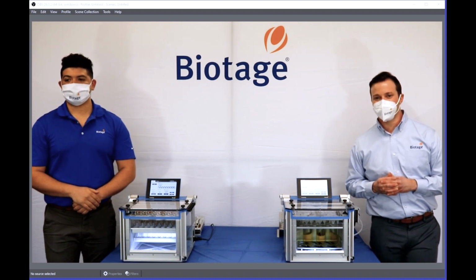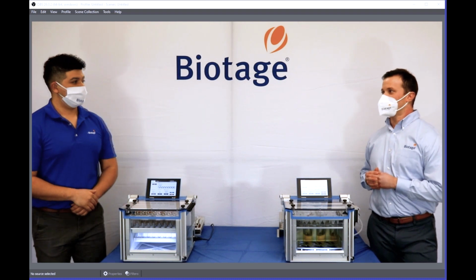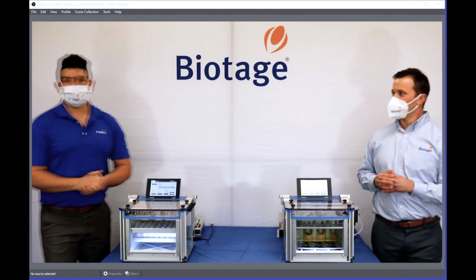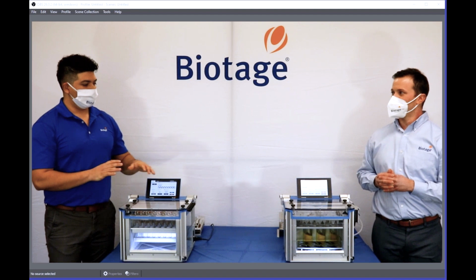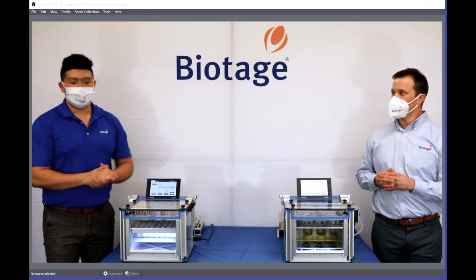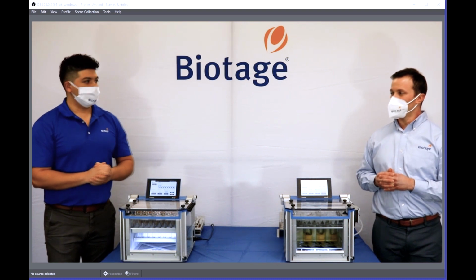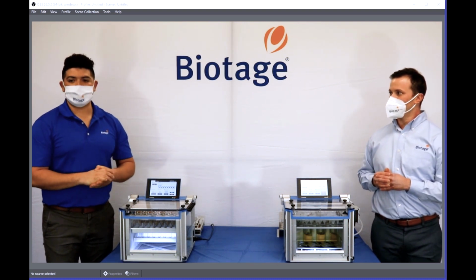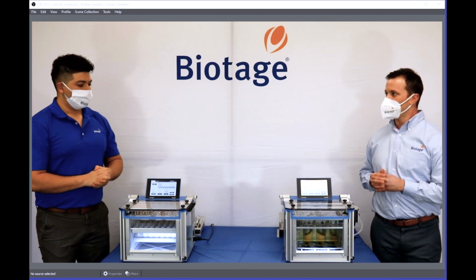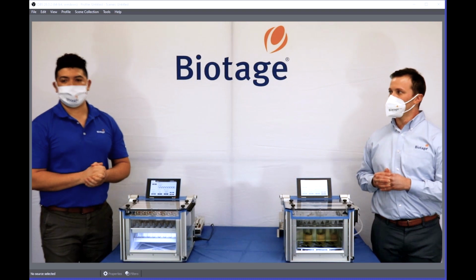Oh, here we go. What PSI ranges can it handle? That's from Raul. I'll let you go with this one. Yeah, sounds good. Thank you, Raul. That's a great question. With the TurboVap, with the new generation, we focus on flow. And I know with the old systems, PSI is something that we use to gauge how much nitrogen you were using. But with this, we can run the 48 at 3.5 liters per minute.